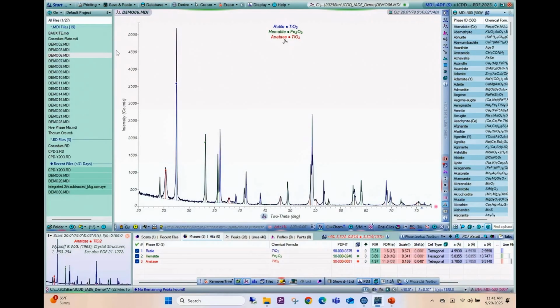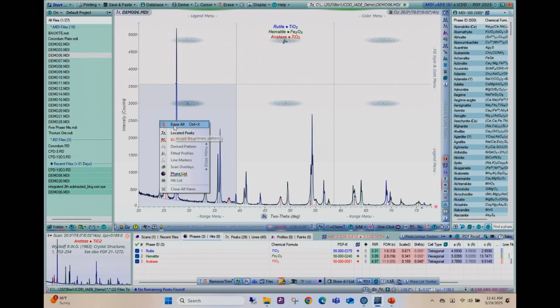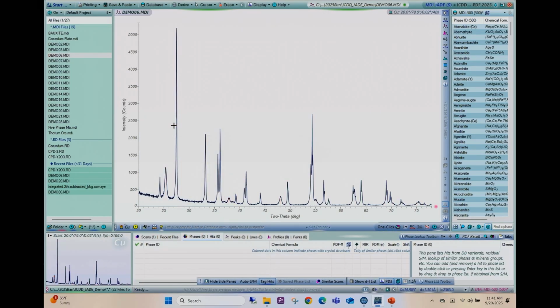When I want to do that, I move my cursor to the bottom left of the plot, right mouse click, and say erase things. So I've erased what I've got. And I showed this example earlier where, on my phase identification, there's this thing called one-click analysis. Now, one-click analysis is okay once you understand your system, if you know what's going on. Robert was talking about quality control, particularly if you're running the same thing again and again and again, you establish some parameters and it just keeps cycling through those parameters. It does pretty good, all right?